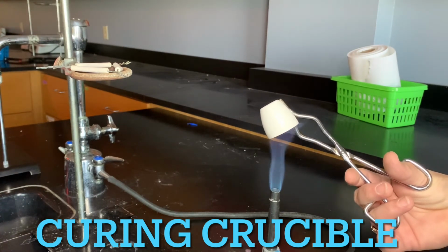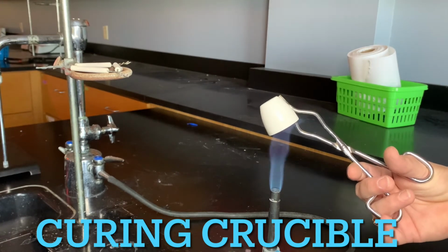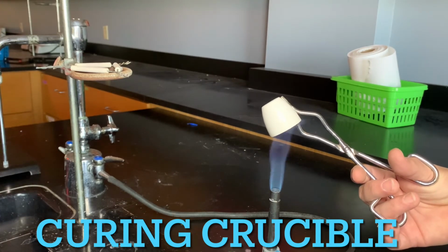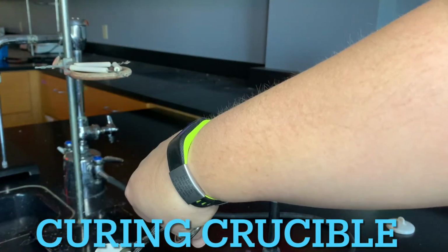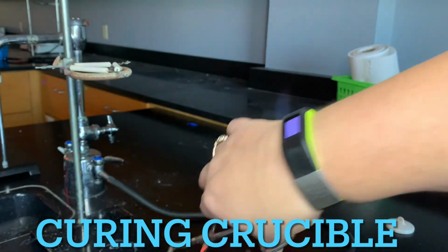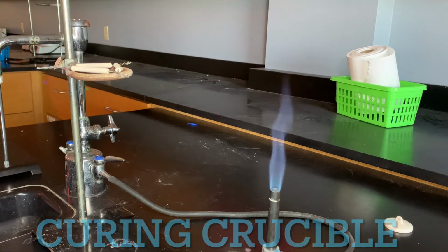Okay. We're going to do what's called curing it. And you need to sit here and cure it for 5 minutes. Once your 5 minutes are done, you're going to place it back, not on this, but on our heat resistant table, away from anything that can break it. Allow it to cool down.